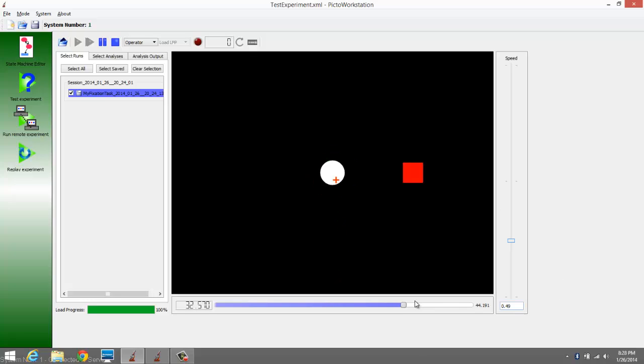You can also jump around. Let's say we want to move back here. So now it's moved back to the previous position. We can jump forward, fast forward up to where we decided to go. You can pause, which is just going to stop where we are, and then maybe you can move around, say move back over here, and then resume. So these are the types of things you can do.